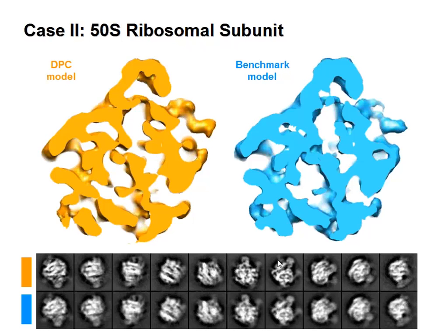Okay, and how widely do things deviate from this map if you play with the threshold? If you pick 0.6 or 0.4, will the maps get more noisy? Well, I haven't actually tested a wide range of thresholds. Conceptually, if we raise this to very stringent criteria, then there will be far fewer particle images in the reconstruction, and then it becomes noisier. So it is always a trade-off, right? But for a sizable data set like 82,000 particles, 0.5 is a reliable empirical threshold.